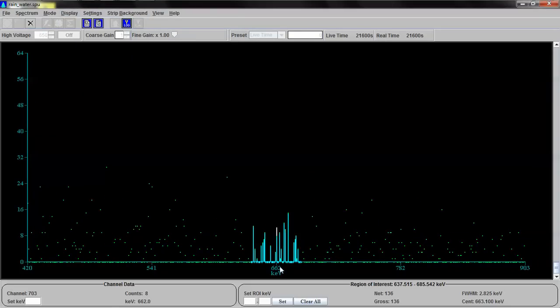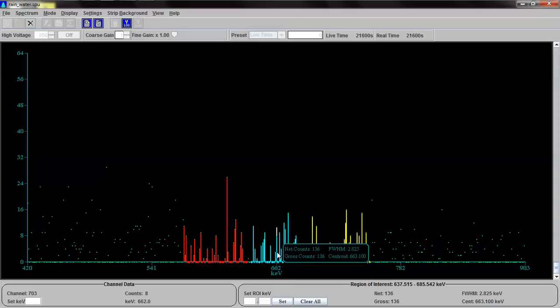See? This whole area right here, everything else seems kind of discontinuous afterwards. And I'm not taking a particularly scientific approach to this because there isn't really a scientific approach when you're dealing with something that's so low it's falling below the statistical mean. But basically put, let's go with 136 counts. I don't believe that's right. I don't believe there's much of any Cs137 in this at all.